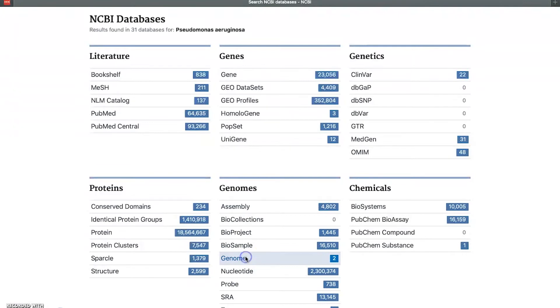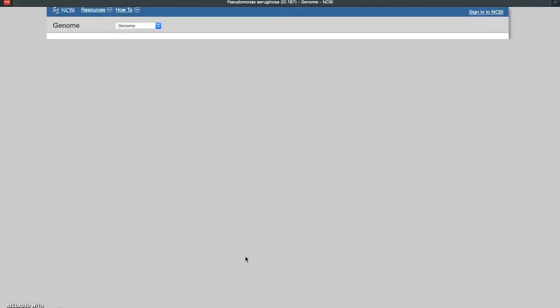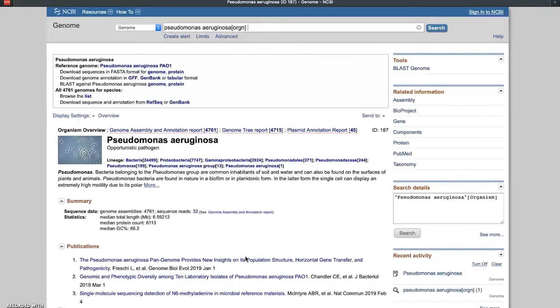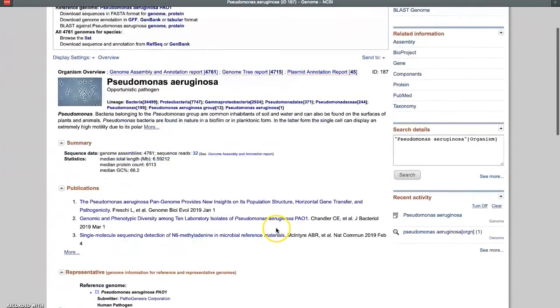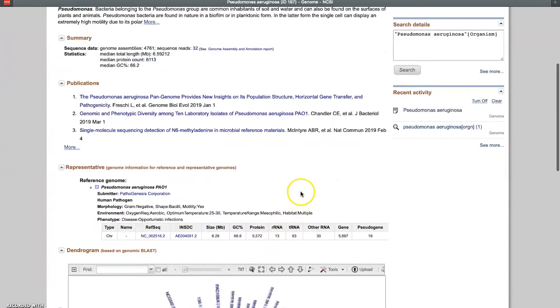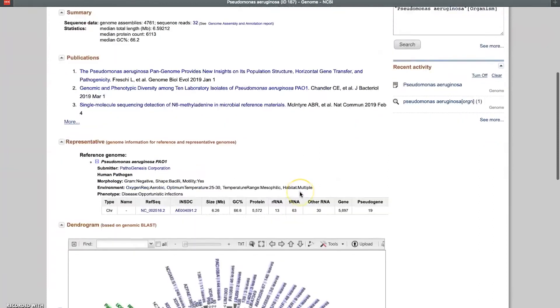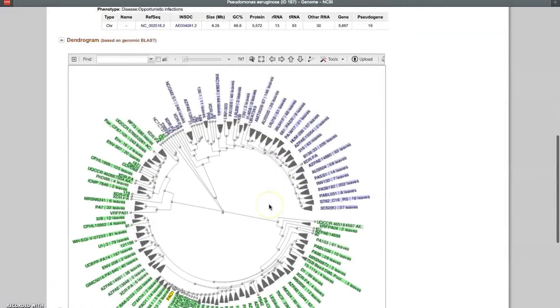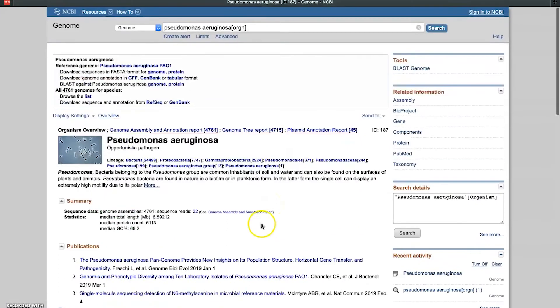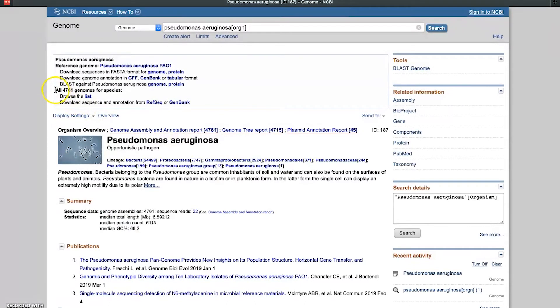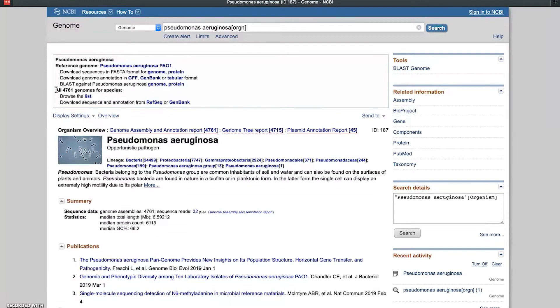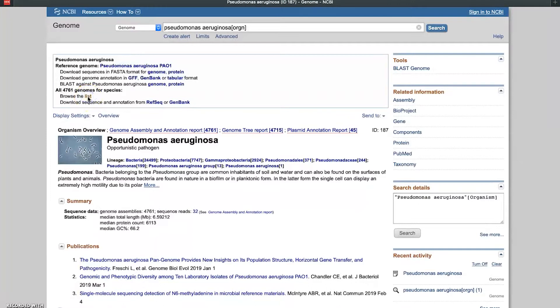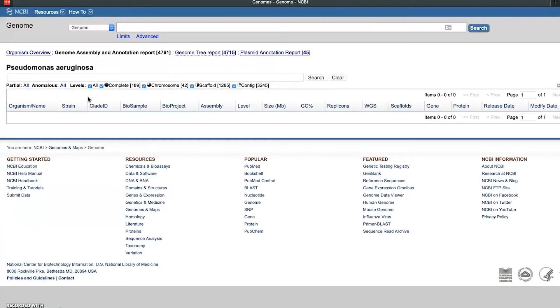We'll just click on that. So it looks like it brought us Pseudomonas aeruginosa, and if you scroll down a little bit there's a lot of metadata here about their reference genome - the size of the genome, a dendrogram, and so on. I want to point your attention though to this line where it says all 4,761 genomes for this species. That's a lot of genomes. So what we want to do is click on where it says 'Browse the list.' List is hyperlinked, so we'll go ahead and browse the list and see what that brings up.